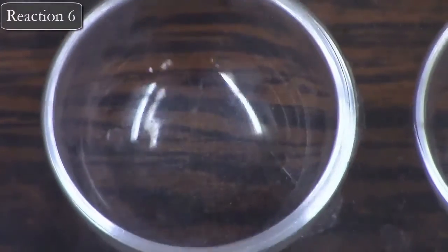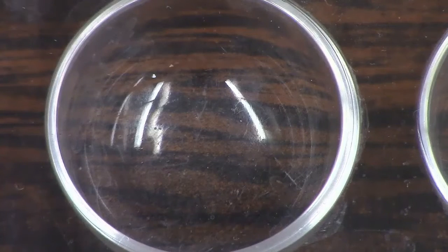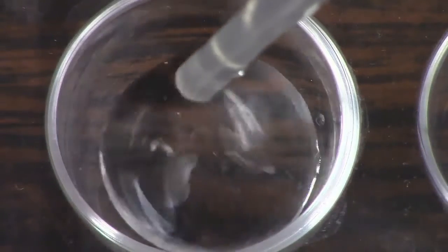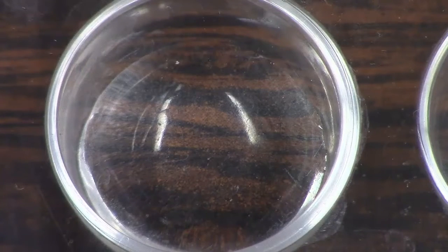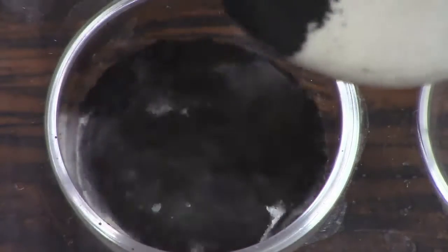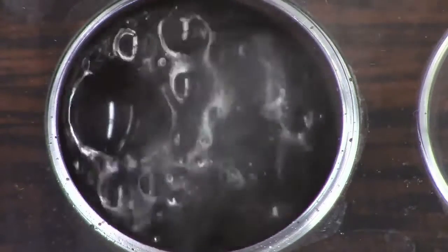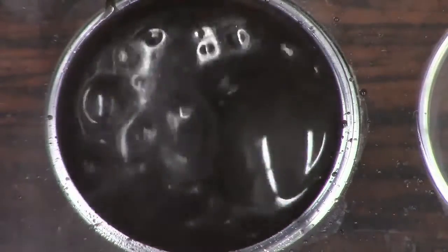All right, now moving on to reaction number 6. So in this reaction, we are going to be adding a few drops of hydrogen peroxide solution to a spot on the well plate. So hydrogen peroxide is a clear solution. And then to that same spot, we're going to be adding some manganese dioxide. So what manganese dioxide does is it acts as a catalyst to speed up the reaction. So think about what might be coming off of that mixture in those bubbles.